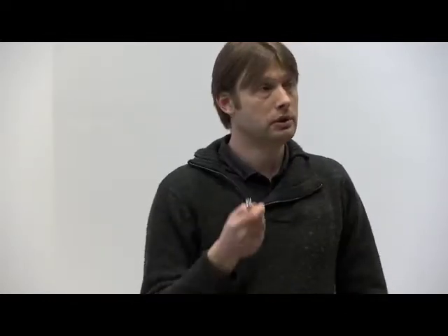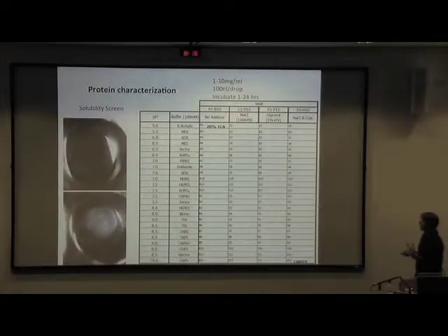It's already in pre-allocated crystallization plates, just like the other ones that we have in the basement. You use a robotic setup to put 100 nanoliters into a 1 microliter drop, so you have a 10-fold dilution, and it's very rapid. If you have high amounts of protein, 10 mg per mL, you will get results within an hour. If you have lower concentration, say 1 mg per mL, then you need to wait a little bit longer to see an effect. But this is a very good way.